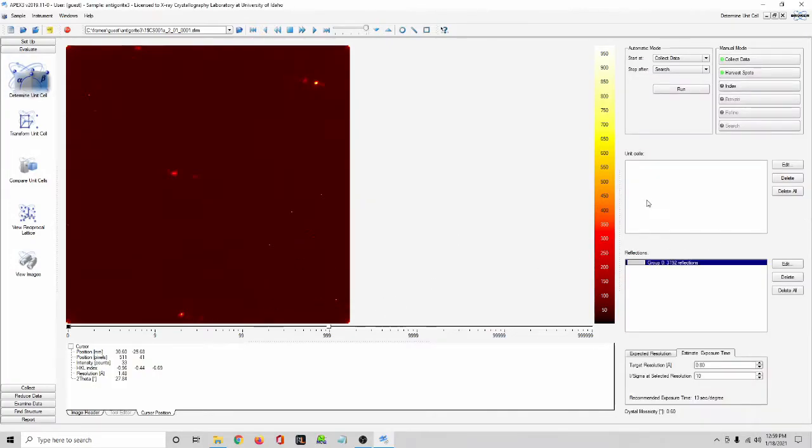All right, now that that's done, first of all, the main reason for doing that is getting a good view of the reciprocal lattice. If you harvest fewer runs or fewer reflections, you may not actually get the full scope of what you collected. So this is good for modulated structures in particular, but also for twinning, or just getting good statistics on your initial solution of the crystal structure. It won't matter that much because the integration refines that, but for modulated structures, this is a critical step.